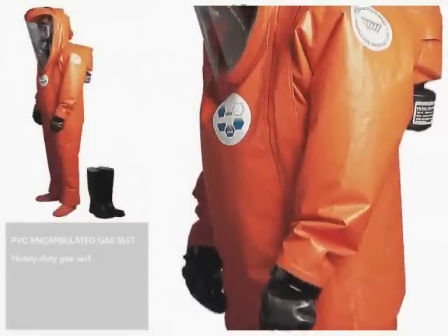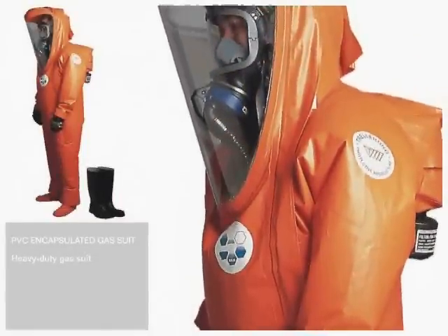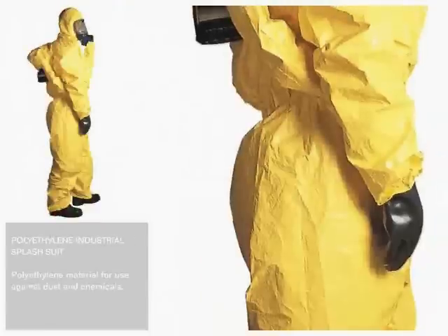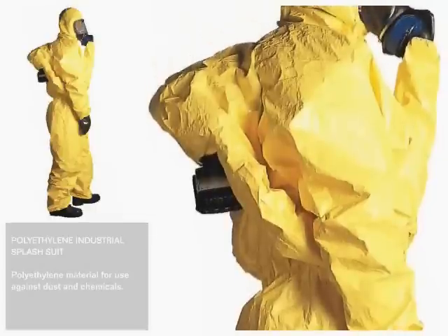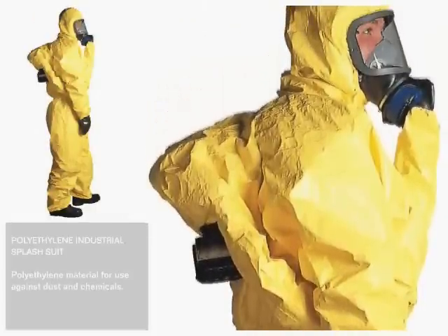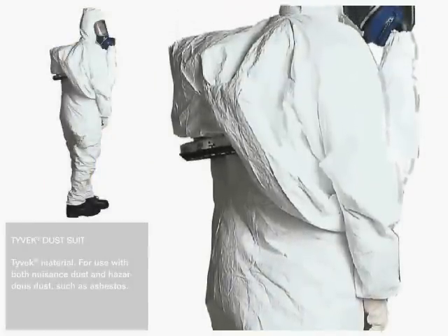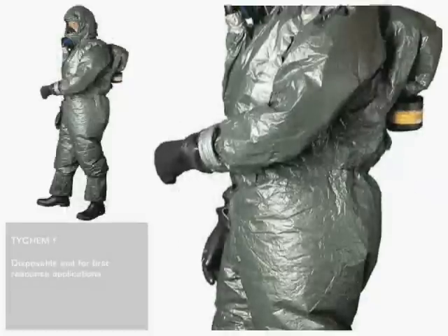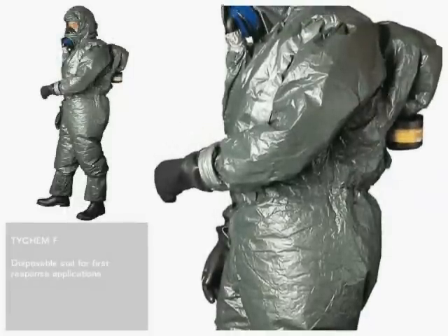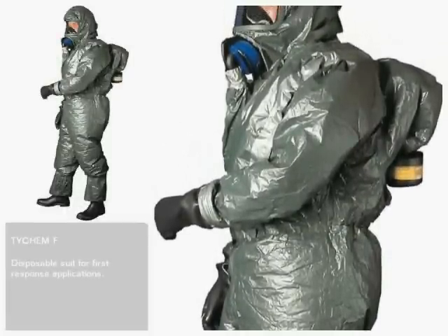The rugged PVC suit is an encapsulated model that can be used over and over again. The polyethylene splash suit is designed to withstand dry dust and wet chemical splashes. The disposable dust suit is used for dry particles such as asbestos fibers and hazardous dust. The Tychem F suit is a military grade suit impermeable to chemical, biological and radiological warfare agents.